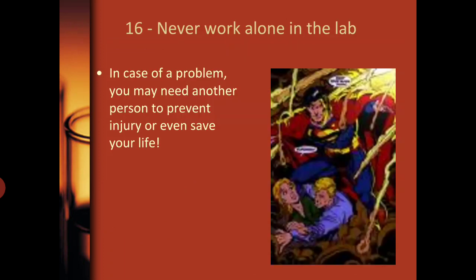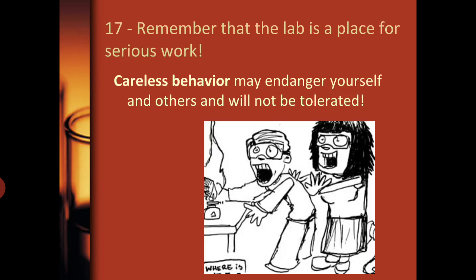And never work alone in the lab. In case of any problem, you may need another person to prevent the injury or even to save your life. So, you need the other person in the lab. Never work alone in your laboratory. Remember that the lab is a place where you are supposed to be serious while working. Careless behavior may endanger yourself and others, which will not be tolerated.